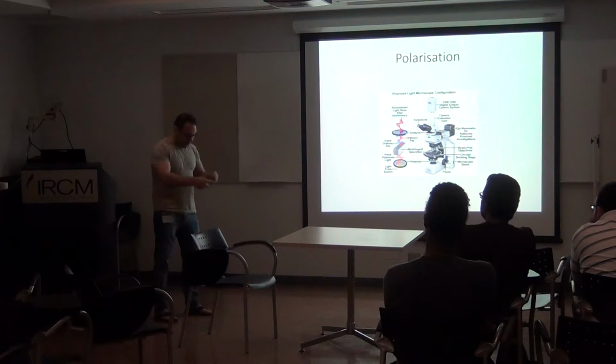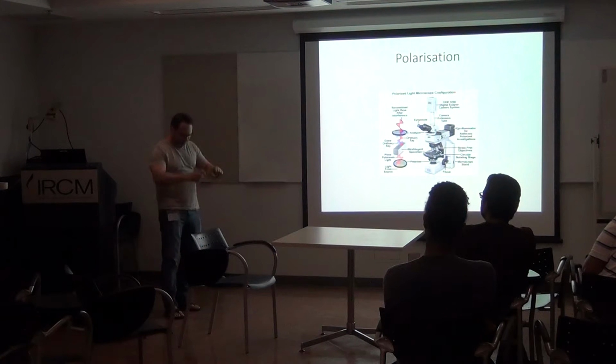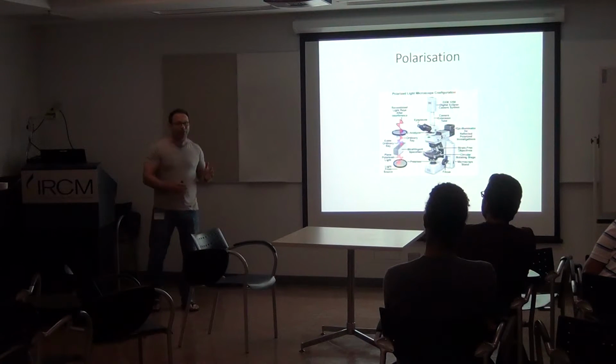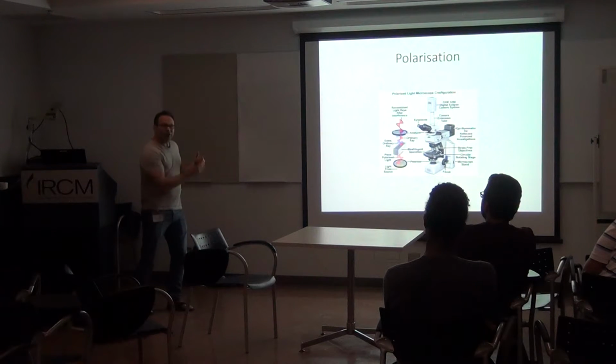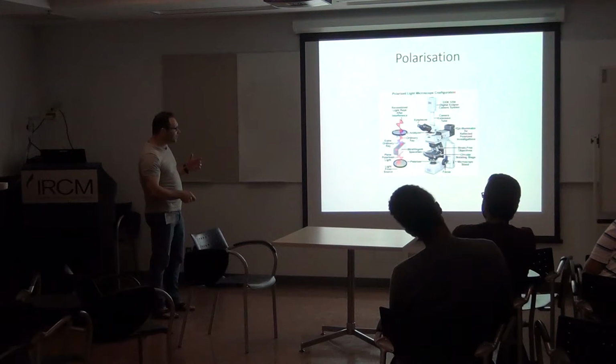Okay? Let's say you have a pen, and I thought I would add it into the presentation, but let's say you have a pen and you use a crystal which is calcite. You look at it and you're going to see two pens in the crystal because some of the light goes in one refraction and the other part will go into the other. So the light turns when it travels into birefringent materials, and you use that fact.